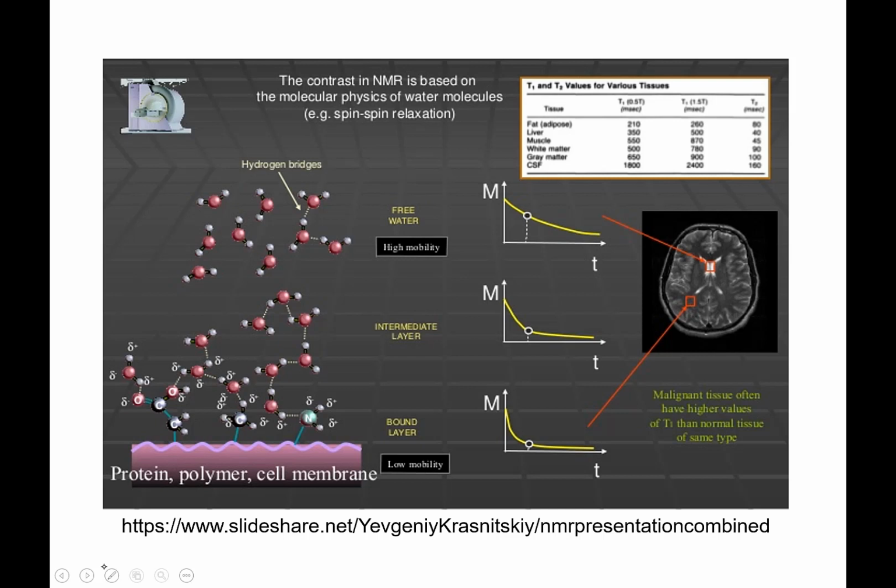So, very simply, the protons, when they get hit by radiation, they go into an excited state. They've got to get out of it. And so the way they get out of it is by colliding with another molecule. Sometimes it's what's called dipolar coupling, where another polar molecule is next to it.